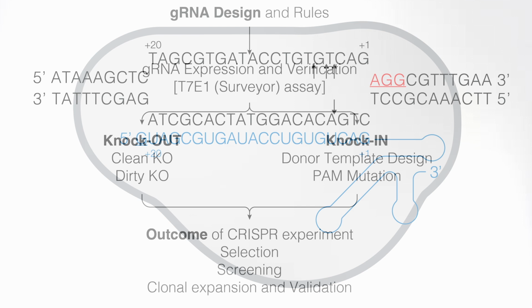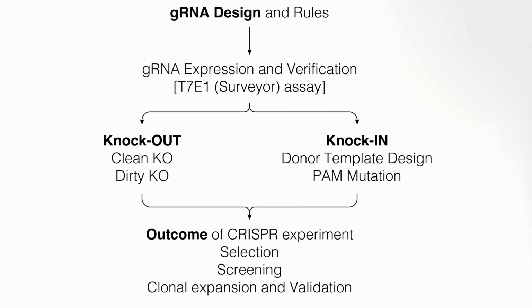Guide RNA design is a small part of the CRISPR experiment workflow. I'll go into some technical details on the next steps in the upcoming video, and I will see you there.